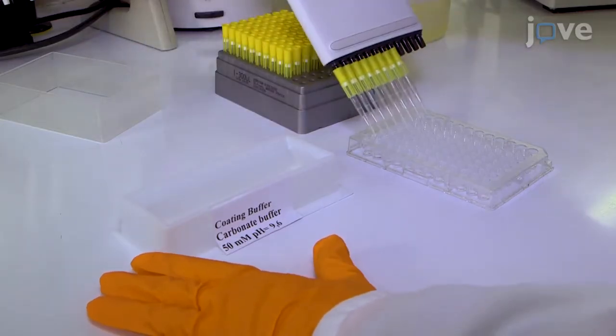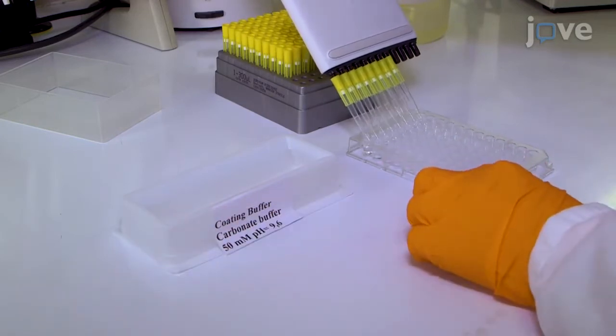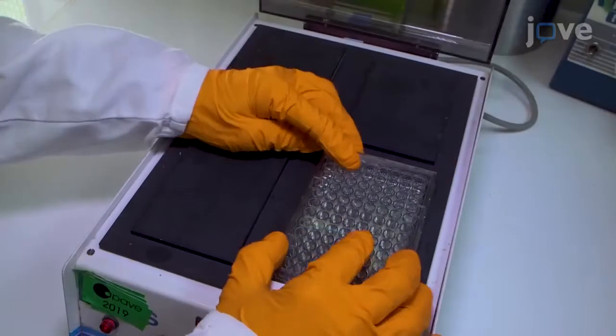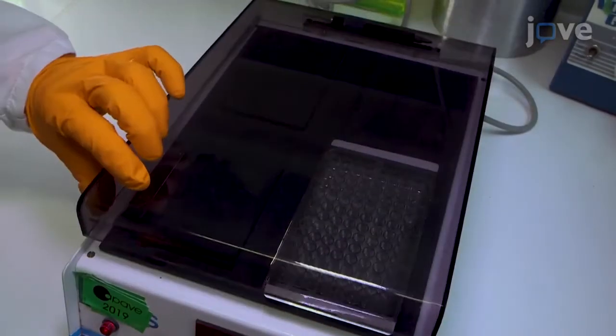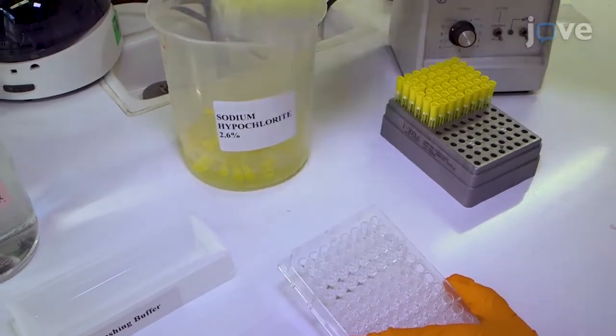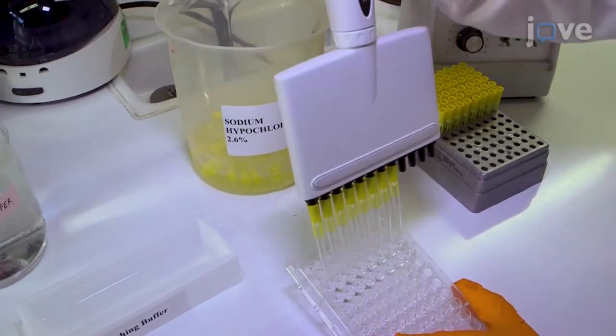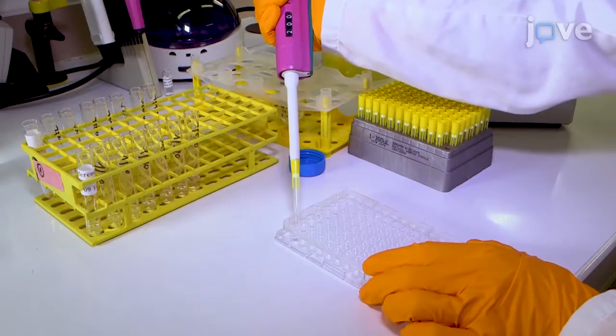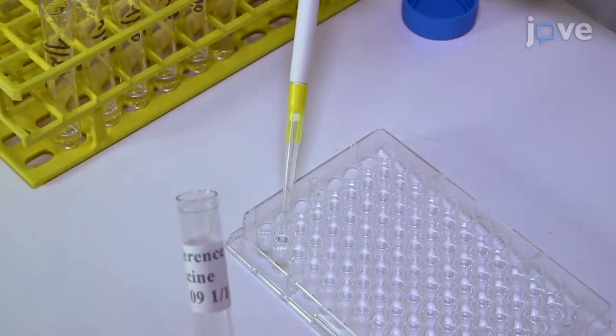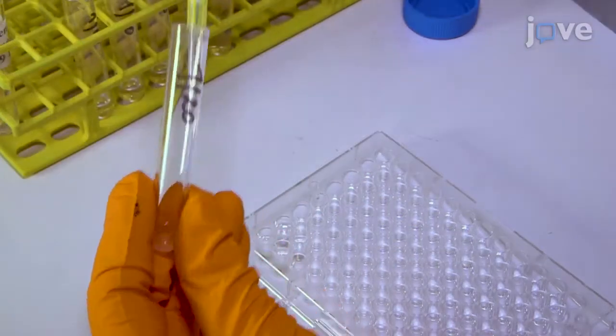This ELISA test shows a good concordance with the classical NIH test in recognizing the immunogenic form of the glycoprotein, shows a high sensitivity, and can be performed within only one day. Evaluation of rabies vaccine potency in vitro by ELISA is an alternative to the in vivo NIH test.